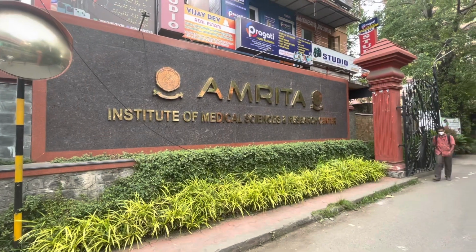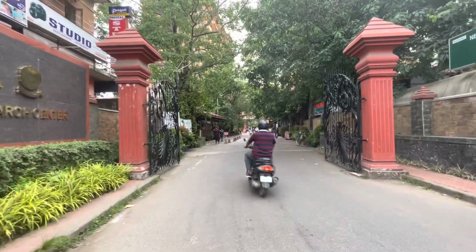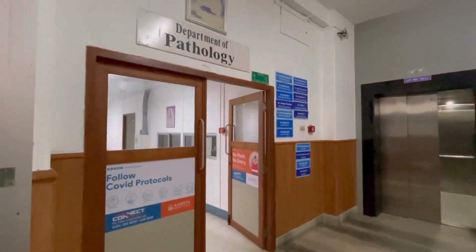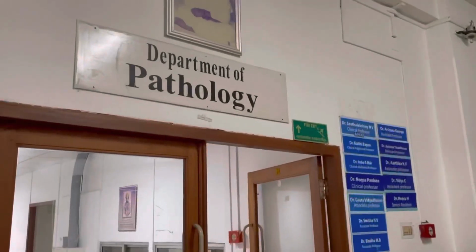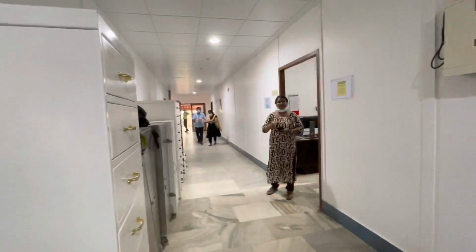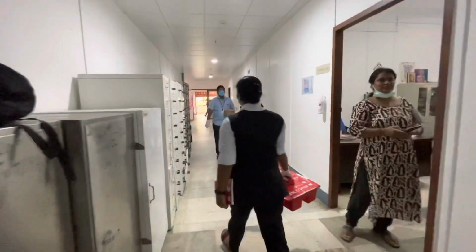Today we will discuss the basics of tissue processing. Tissue processing is the technique by which fixed tissues are made suitable for embedding within a supportive medium such as paraffin and consists of 4 sequential steps: fixation, dehydration, clearing and impregnation. But before any of this is done, the sample is received.